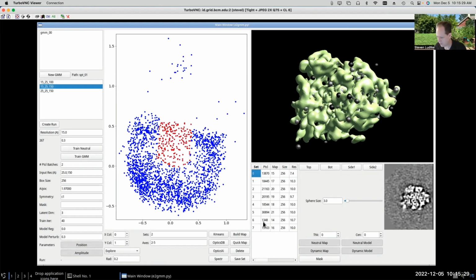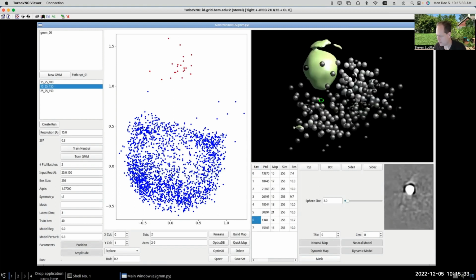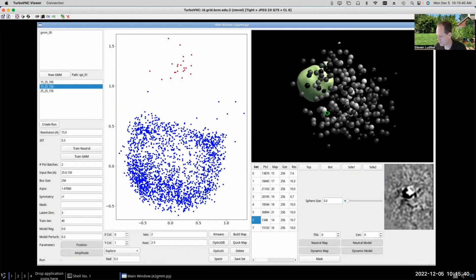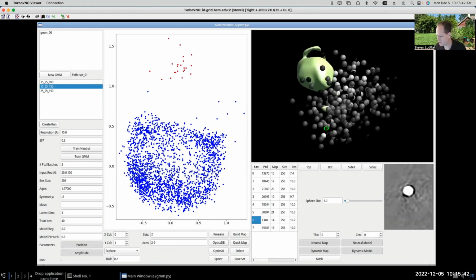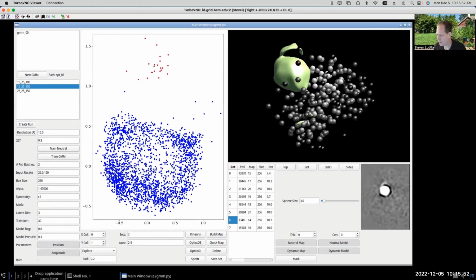If we look at this small subset right here, that's these particles up here, and these are the bad particles. So it's basically just a blob in space, although it's got a little 3D structure to it if we look in the right orientation. Anyway, these are just bad particles up here. Okay, I think that's all I wanted to say about the Gaussian mixture model stuff this week.